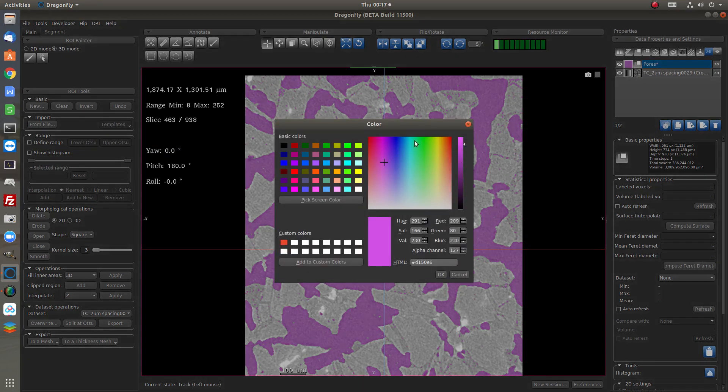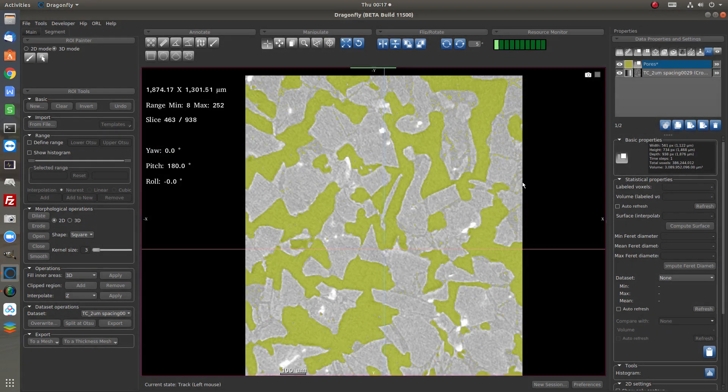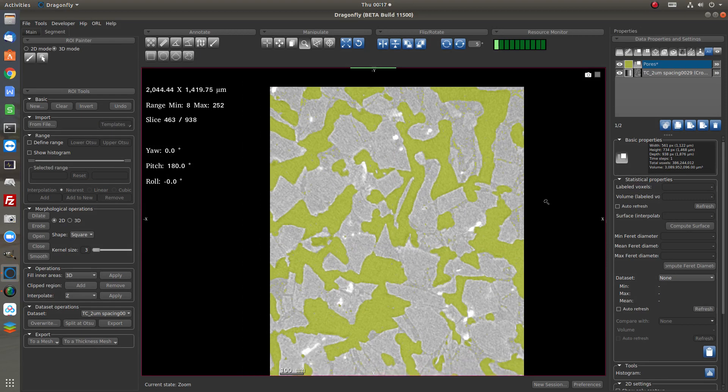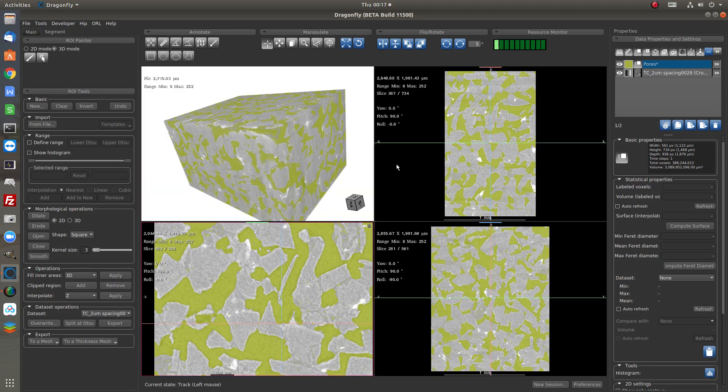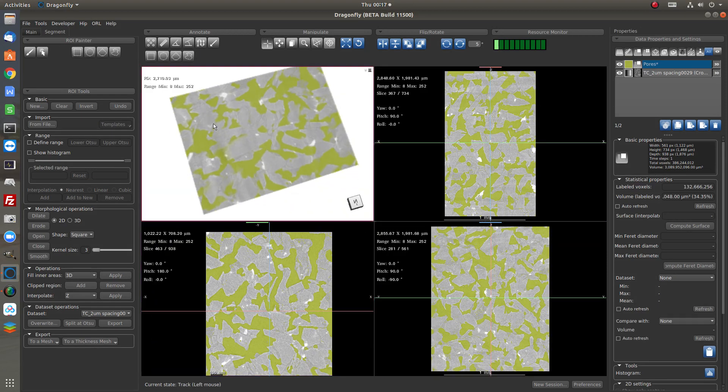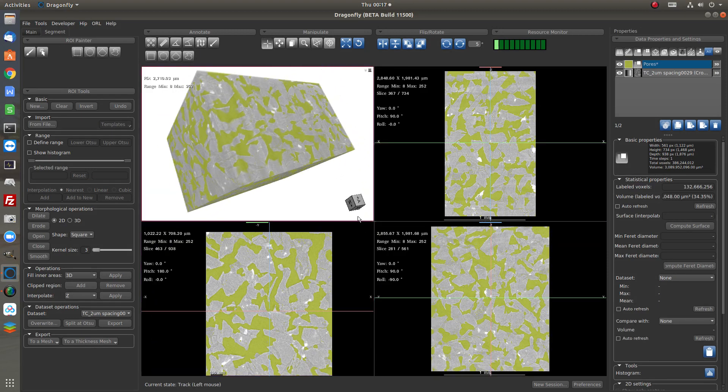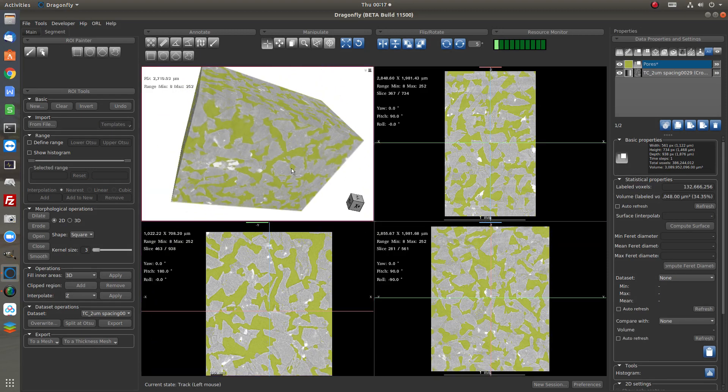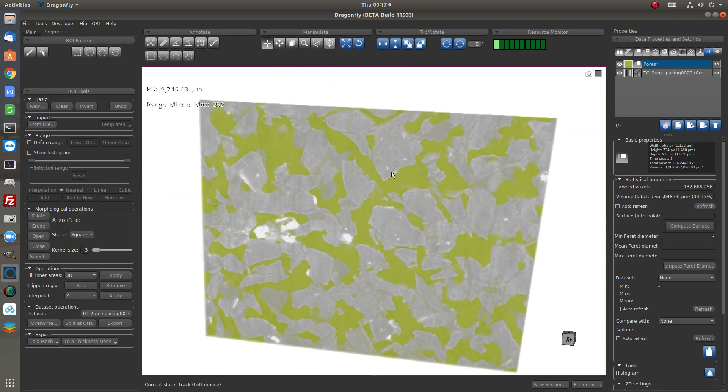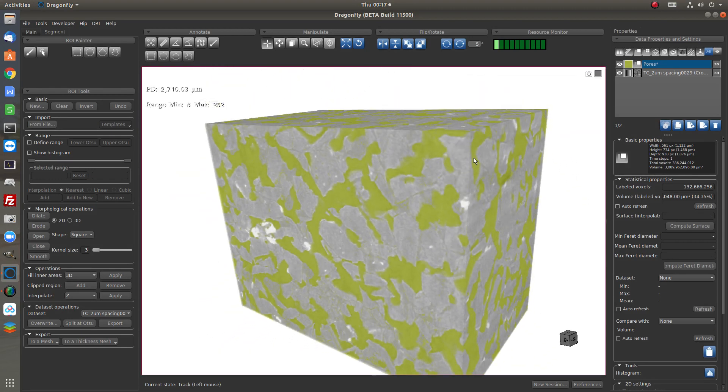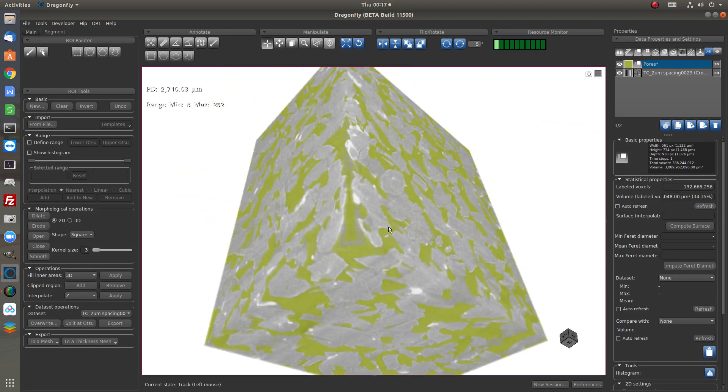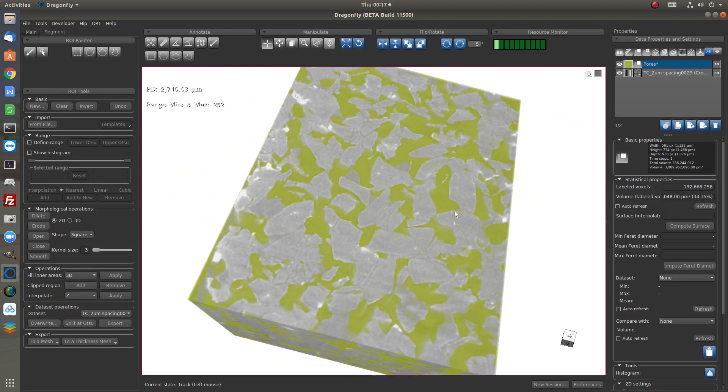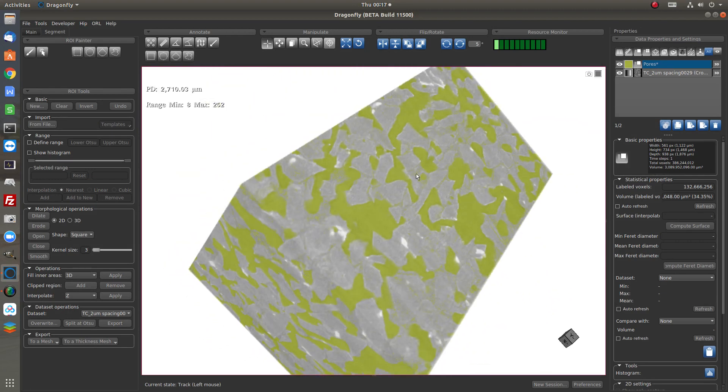So the color we can change it to something else. So if we see this in 2D and 3D, the 3D volume rendering, we see the matrix and the pores in color.